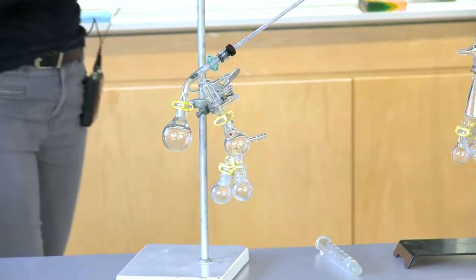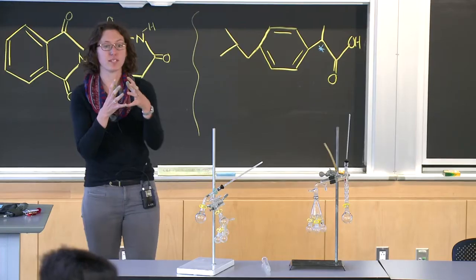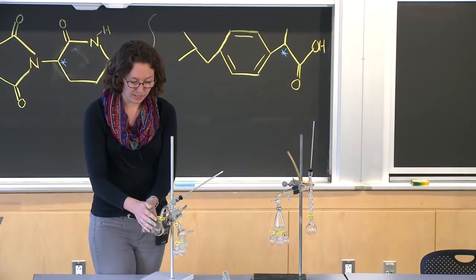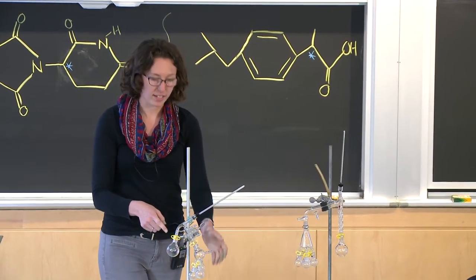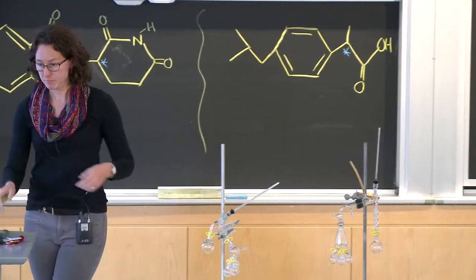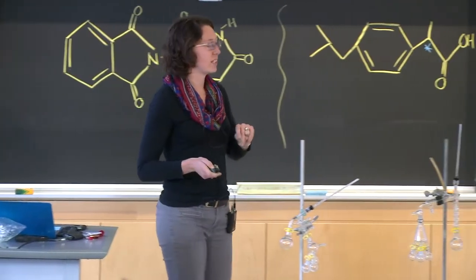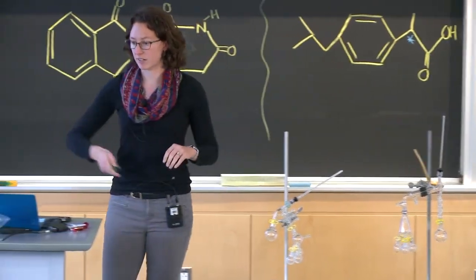So the way that distillation works is if you have either a mixture of two liquids that have different boiling points, or if you have a liquid that has some non-volatile impurities in it, you can put your mixture in here, heat it up, and then recondense the vapor, and then you can collect, hopefully, your purified substance at the end of it. So if we have this mixture of two liquids, then we need to talk about different laws that govern how two liquids and how two vapors interact with each other.